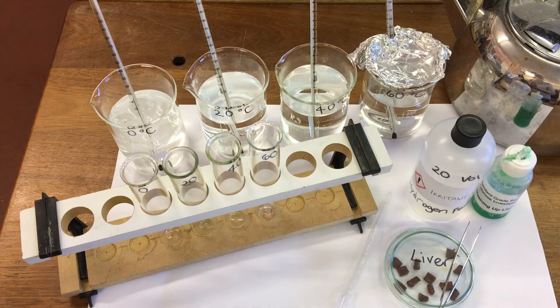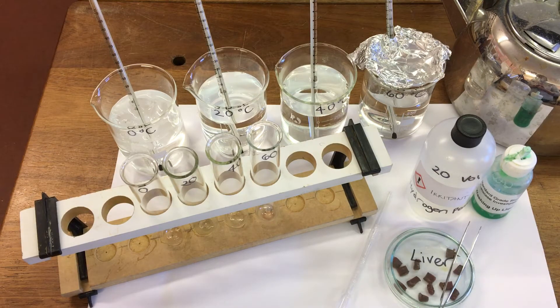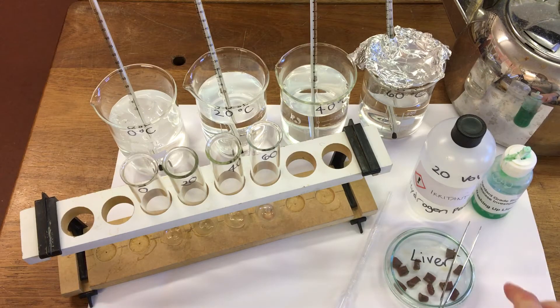In this experiment we're going to look at how temperature affects enzymes. We're going to look at the reaction of hydrogen peroxide and we're going to use the enzyme catalase which is contained in liver.